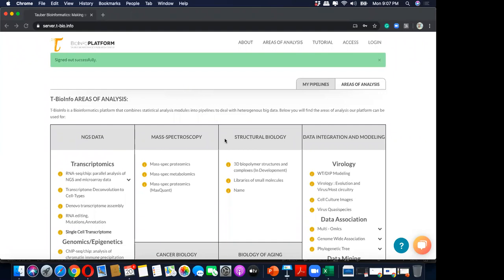Okay, great. Only two people have said yes here. How about the rest? Have you not been able to come to this page? Server.t-bio.info. Please try to log in. If you're using your mobile, it will be problematic. If you're using your laptop, then you can easily access this page. It is important because we will be running the analysis and doing the pipelines together.